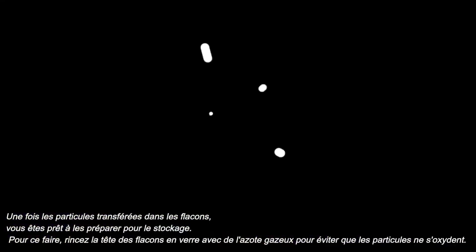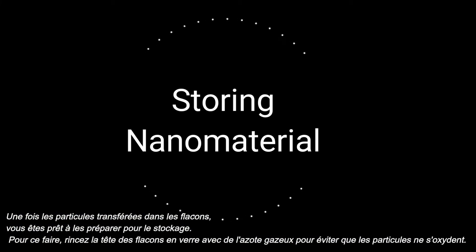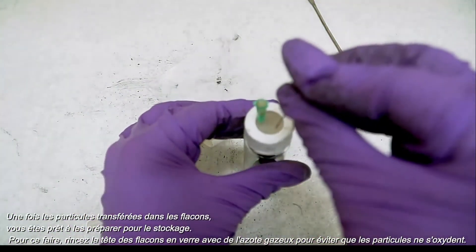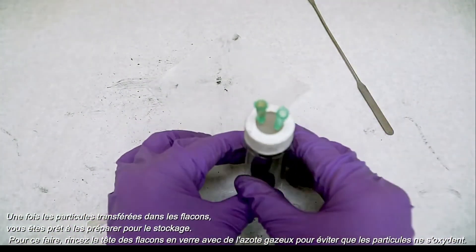Once you have finished transferring your nanoparticles, you can now prepare them for storage. To do this, flush the head of your glass vials with nitrogen gas to prevent the particles from getting oxidized.